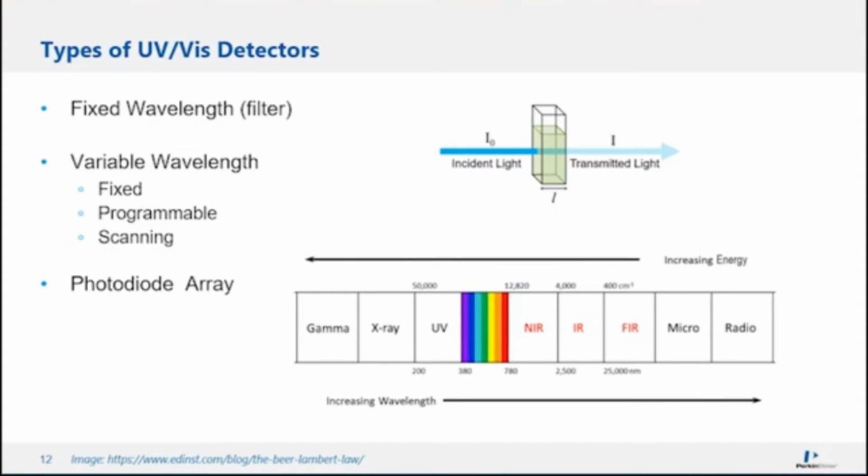When light of a certain wavelength is directed at a flow cell, the substance inside the flow cell will absorb the light. As a result, the intensity of the light that leaves the flow cell is less than that of the light that enters it. An absorbance detector measures the extent to which the light intensity decreases, i.e. the absorbance, after the sample interacts with light. The sample can be collected or disposed of, making it a non-destructive detection method.